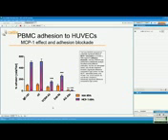A similar experiment we repeated with PBMCs. PBMCs are isolated from blood donors, and this is completely different. You can see that now the MCP1 has a significant effect. We can see that the non-stimulated cells practically don't adhere to MCP1. And also we can observe quite nicely the effect of antibodies, both VCAM1 antibodies, E-selectin, and two antibodies in combination.